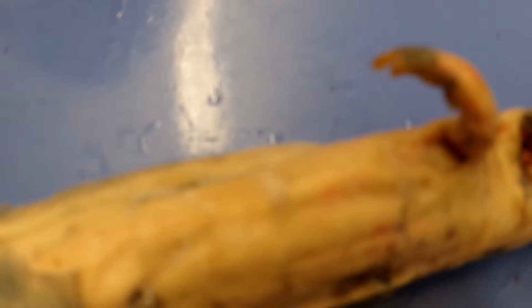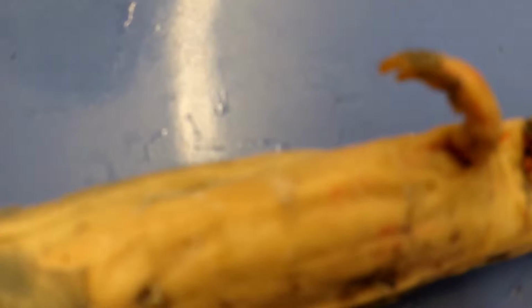The next three muscles are the external oblique, internal oblique, and the transversus, which are found on the side of the animal right here. They all originate from the transverse processes of vertebrae. Their insertion is the connective tissue of the rectus abdominis, and they are all homologous to the hypaxial muscles in the shark.